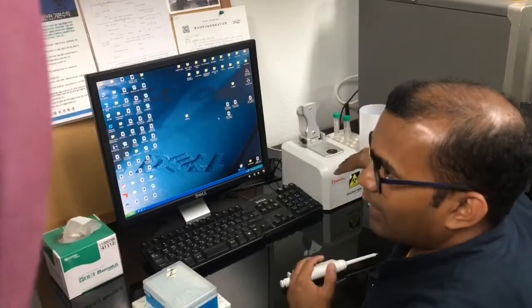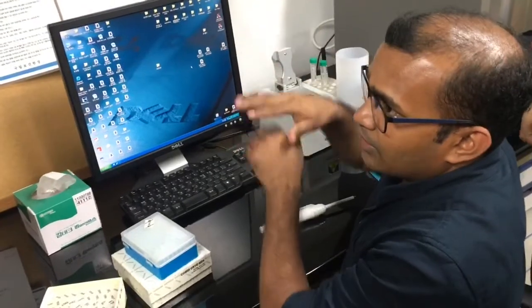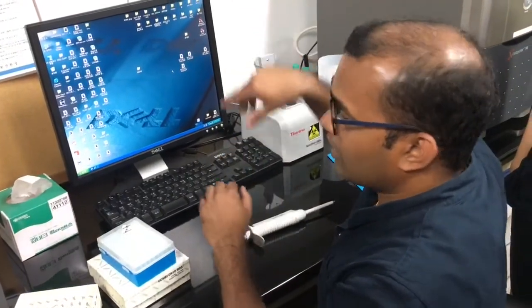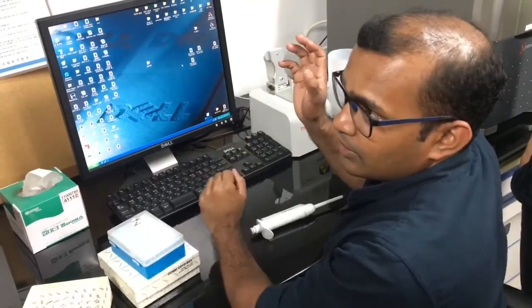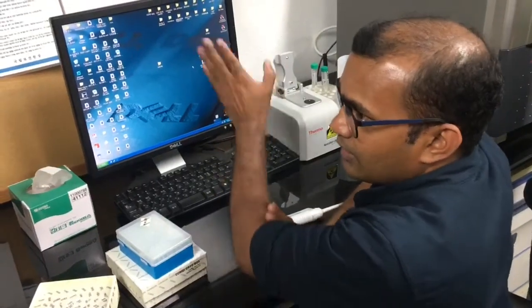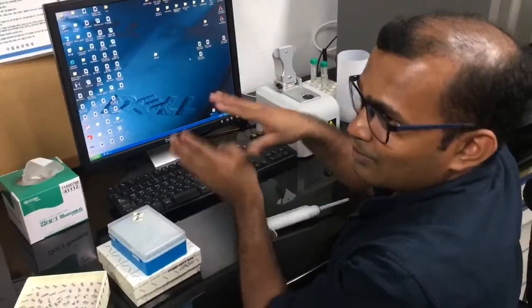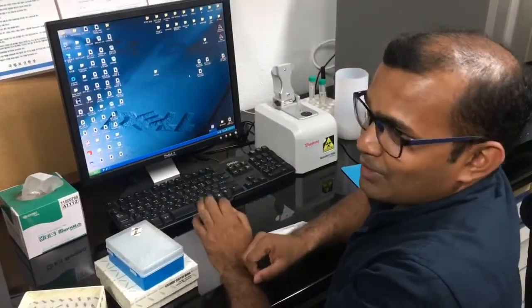There are lights in the measurement process. Through the lights, it will measure how much concentration is in the sample, a small amount. So it will give a kind of curve. Then we check that curve under the particular nanometer wavelength and how much concentration is under that curve, and the shape of the curve, whether it is fine and nicely or evenly distributed, or it goes up and down, something like that.